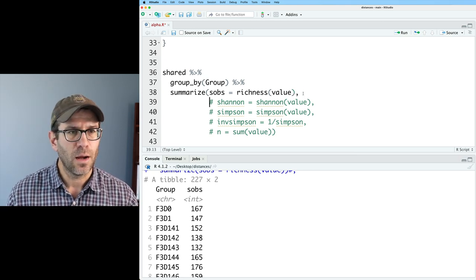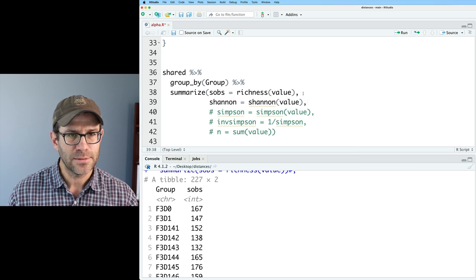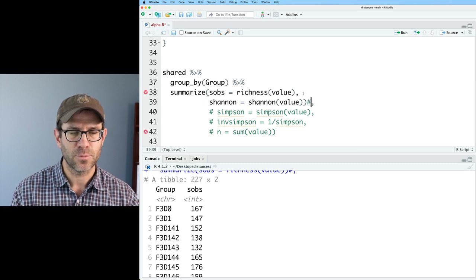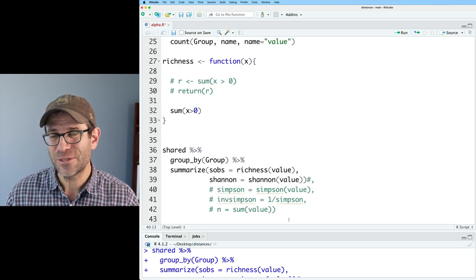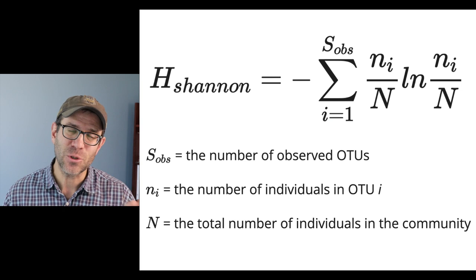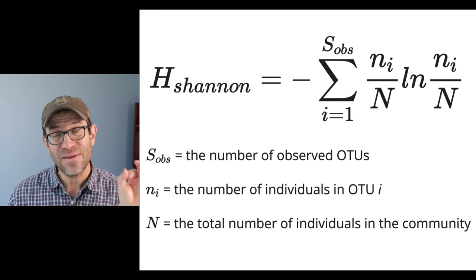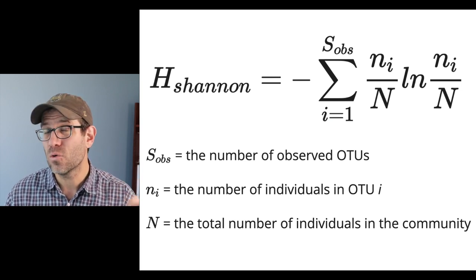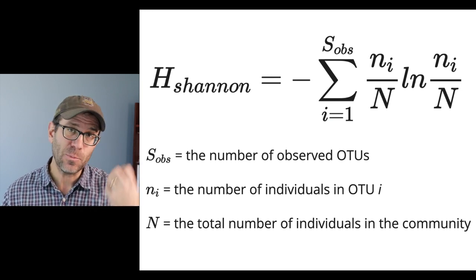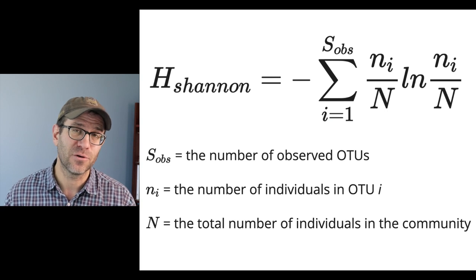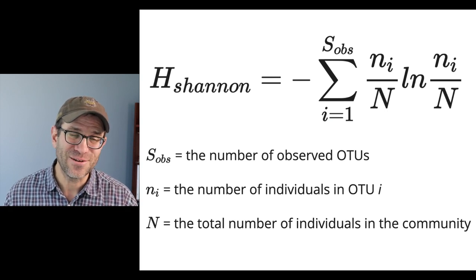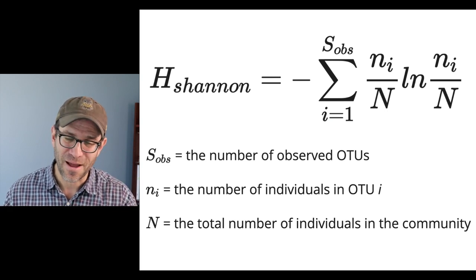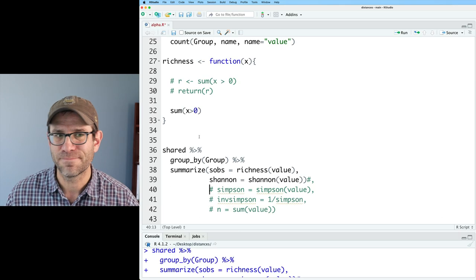So I'm going to go ahead and uncomment that and put the closing parentheses here. So what I'd like to encourage you to do is take this formula that I'm showing here on the screen and see if you can write your own Shannon function that will output the Shannon diversity index. I'll give you a second to do that and then come back and I'll show you how I'll do it.